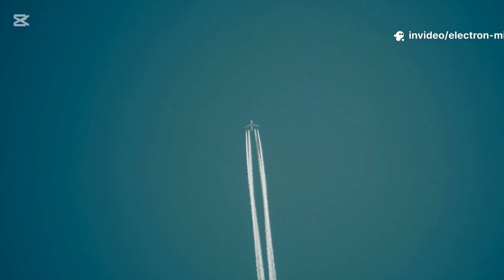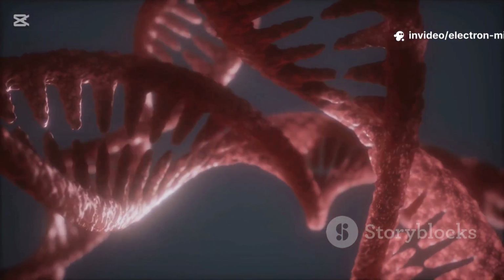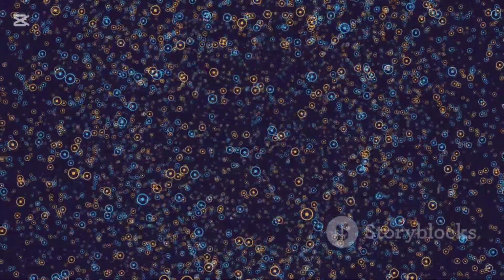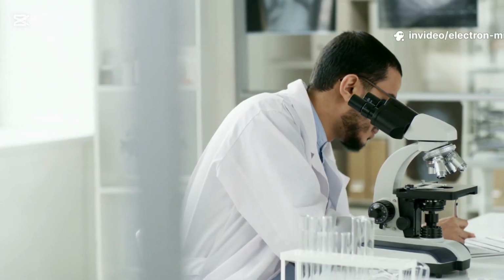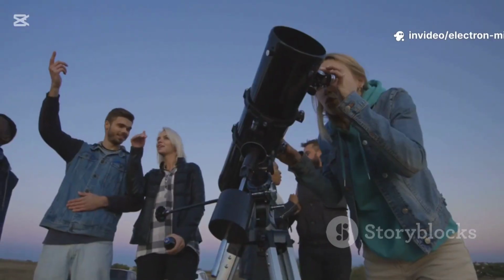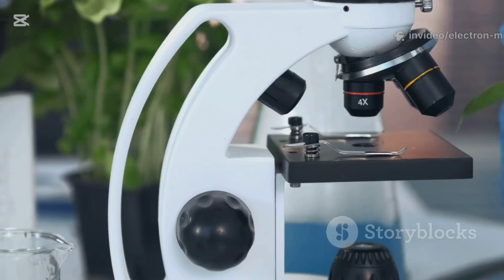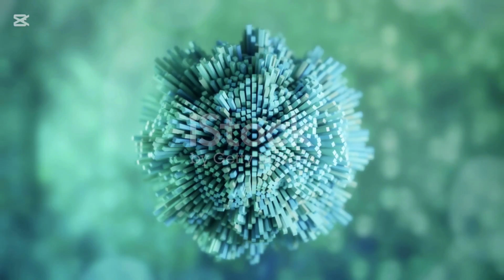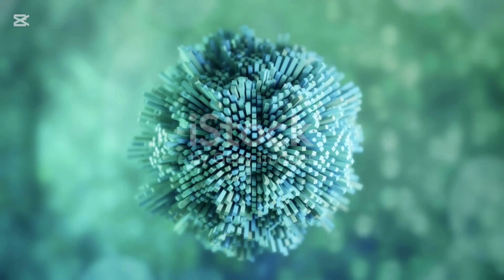From a universe on the tip of a needle to the blueprints of life, EM transformed our place in the cosmos. There is as much wonder below as above. By using electrons instead of light, we opened a new dimension for exploration. TEM looks within. SEM reveals surfaces. They extend our oldest curiosity, turning the gaze inward and downward. Every answer about proteins, metals, and viruses fuels progress.